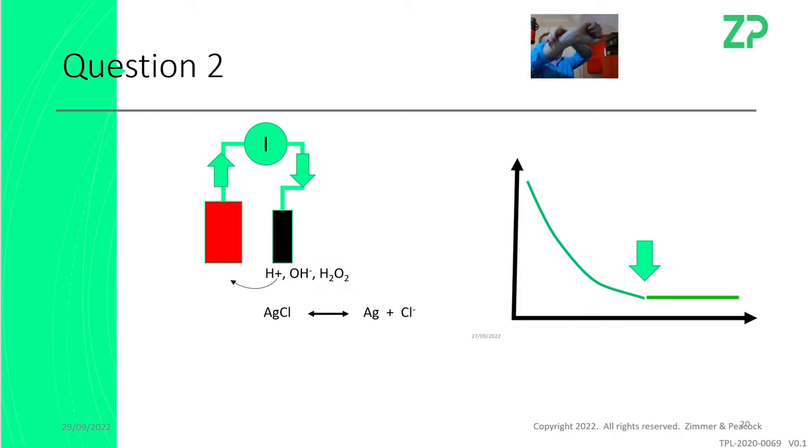And so the questioner says, well, is your counter electrode silver chloride? Yes. And you've discovered that, and it's also in the data sheets. It's smaller, yes, because actually silver chloride is quite facile. And the reason we do it is because in my career, I've seen this phenomena. And so when people are building biosensors upon our screen printed electrodes, they're automatically protected from this phenomena. It doesn't always appear, but it does appear. And when it does appear, nobody knows why it's there. And it's really due to chemical crosstalk between the counter electrode and the working electrode. And it creates this kind of feedback loop where current just keeps on going up and up and up.